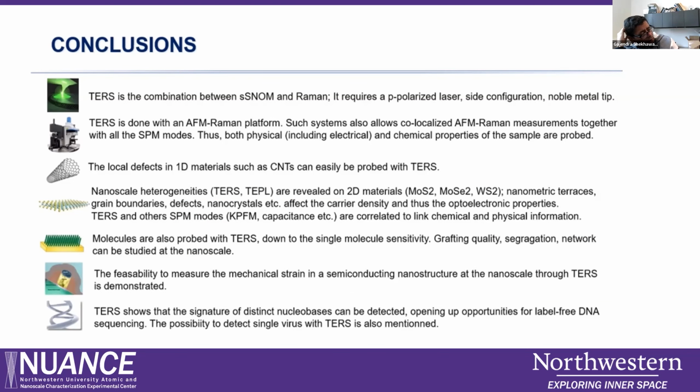Basically, you are breaking the limitations of a 0.5 micron optical resolution with far-field optics. Here, you can go down to a few nanometers with SNOM, so you can see the plasmonic effects in these 2D materials. So that's also a part of this system. And then the TERS is done with an AFM Raman system, so you can do co-localized measurements.